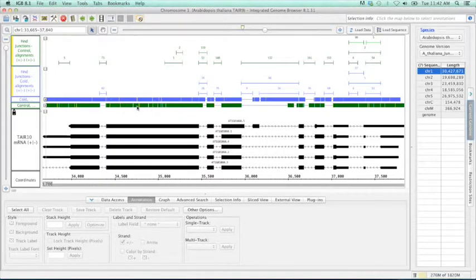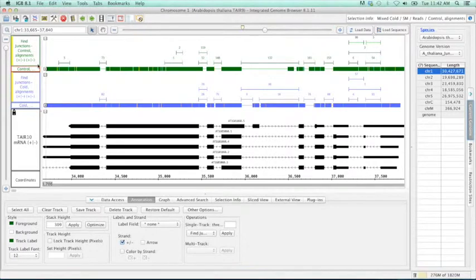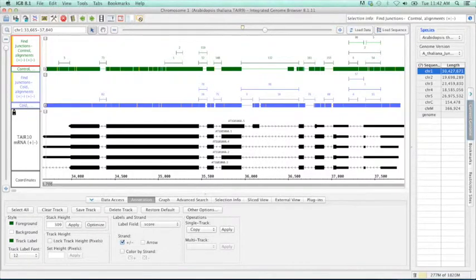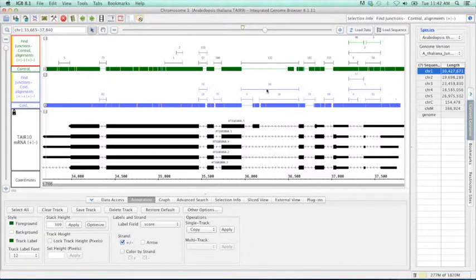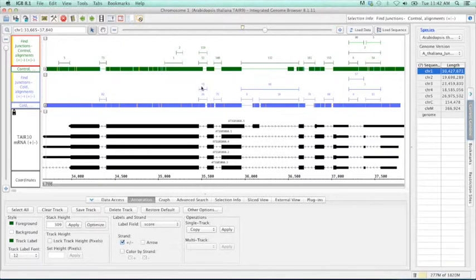And then I'm going to go ahead and put each track next to its other track, so controls and our experimental are together. Each junction has a numeric label indicating the number of gapped reads that support that junction.